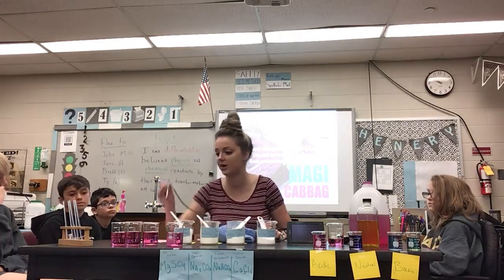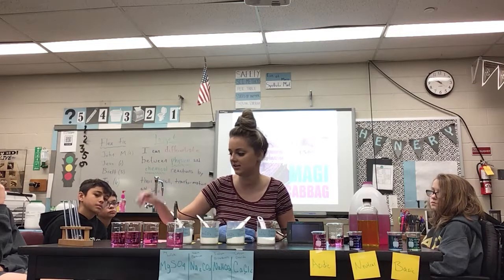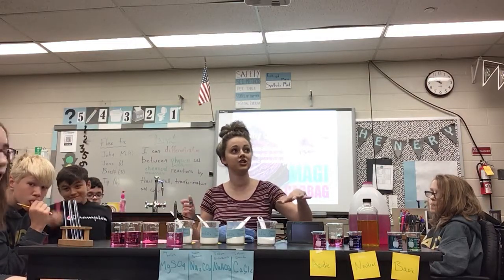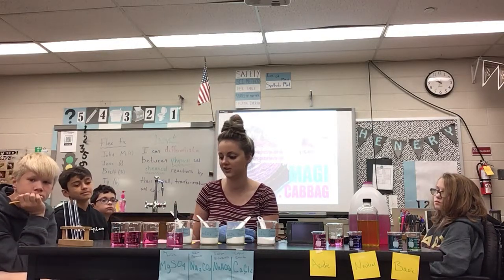Okay, so we were at what you said, 70.2. Let's take a look at what this temperature is. Okay, wait for it to kind of start to solidify. While the temperature is changing, answer yes or no. Was there a color change? No, not really drastic.